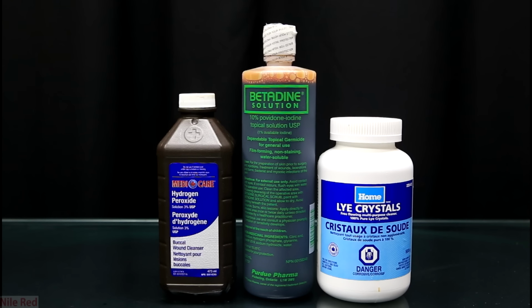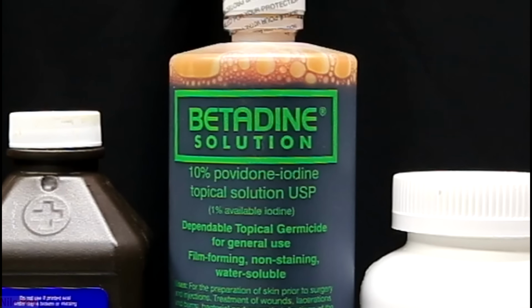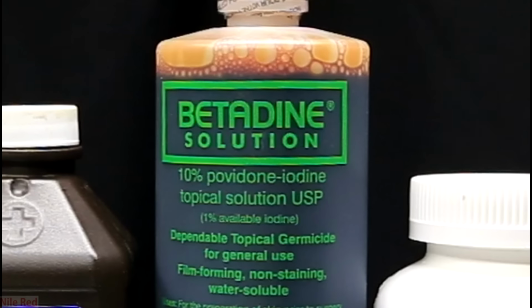Anyway, now to get more into the details of the actual experiment we're going to be doing. In many pharmacies, iodine can be found in the form of iodine-povidone solution or iodine tincture. This video is going to focus on the extraction of the iodine from the iodine-povidone solution, and I might explore the iodine tincture one in the future, but I'm not sure. Before we start off though, let me just say that it's a pretty costly method to get elemental iodine, and it's much cheaper to just buy it directly.